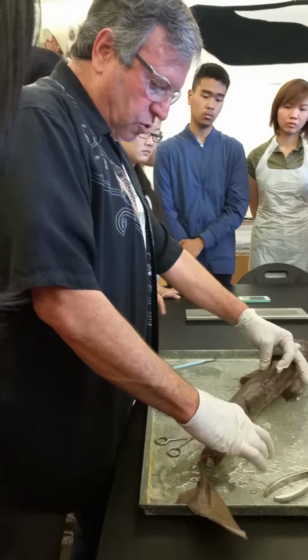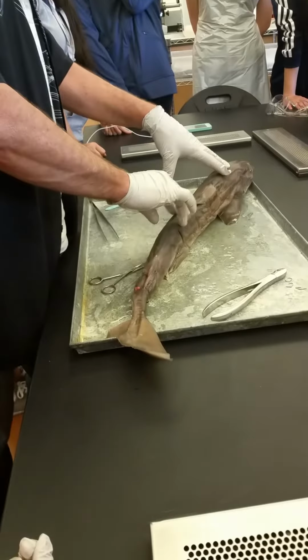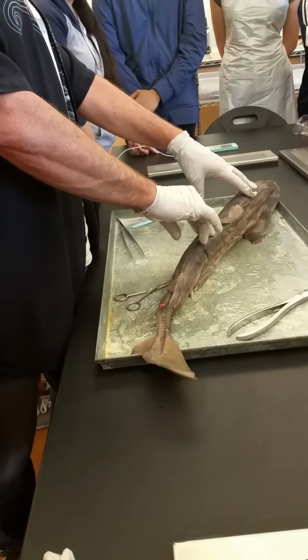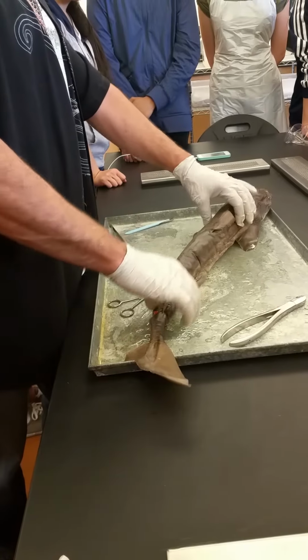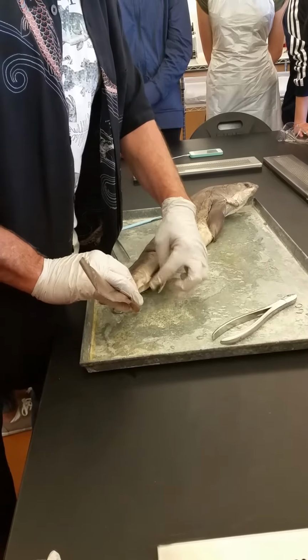But so here we have our two dorsals and our caudal fin, our unpaired fins. Now this particular family of sharks are called the Squalidae. They don't have an anal fin, but other sharks would have an anal fin here right behind the anus. Okay.